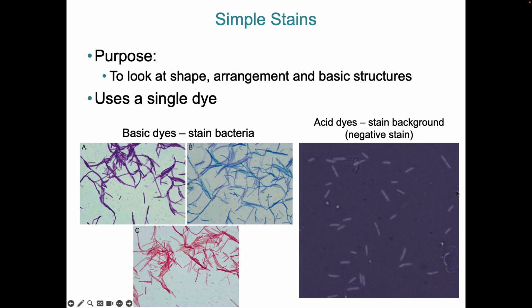This is an example of doing an acidic dye where the chromophore or the dye molecule is negatively charged, so it's repelled by the cell. And I like negative stains. They're a little bit tricky to do, but I really like them when they work well. So these are also rod-shaped bacteria, but you can even start to see where they've started to divide, and you can see the little cell divisions there. So it gives a little bit better detail of the surface of the cell.